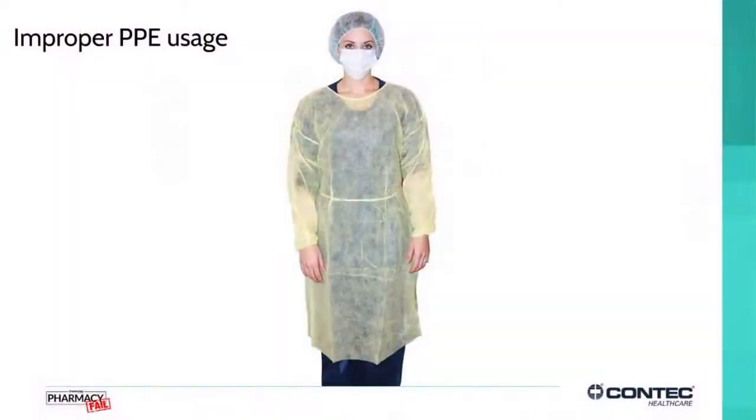And it's not always the right PPE. You really have to consider what you're wearing in a clean room, and that's not always the case. We've got a picture of a polypropylene spunbound gown up here that we've seen over the years that comes through central supply, and that's really not an ideal gown for a pharmacy. It has a very thin particle barrier, so, we are the biggest source of contamination, right?